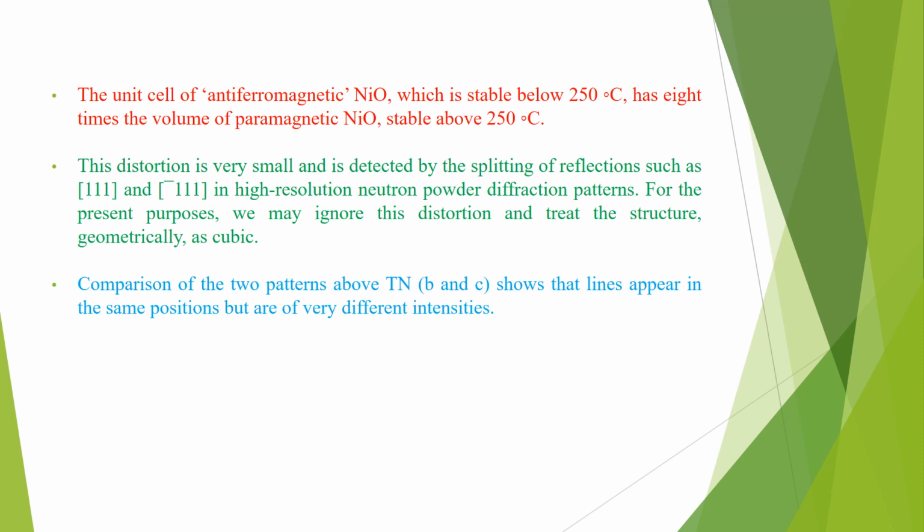Neutron powder diffraction patterns for manganese oxide, which behaves very similarly to nickel oxide, below and above the Néel temperature Tn, together with a schematic powder X-ray diffraction pattern at room temperature, are shown in the following figure.